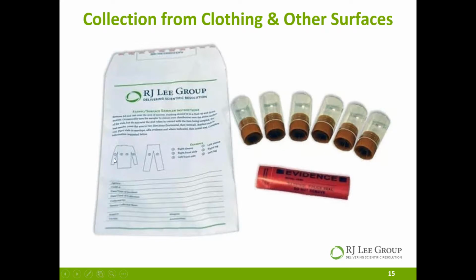It's kind of hard to see, but the numbers here are 1, 2, 3, 4, 5, 6. So you could label a stub as 1 and sample from the right sleeve, as 2 and sample from the right side. But just because this is an example of what to do does not mean that you have to follow it. That's why the stubs are blank. You're welcome to label it any way that you like. You can use those stubs in any way that you like.